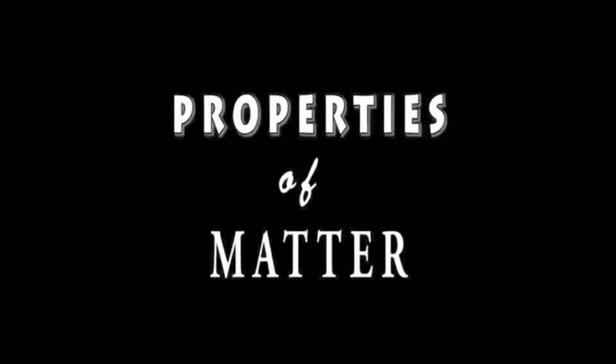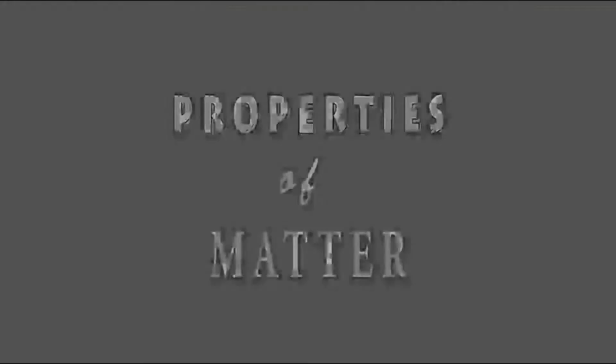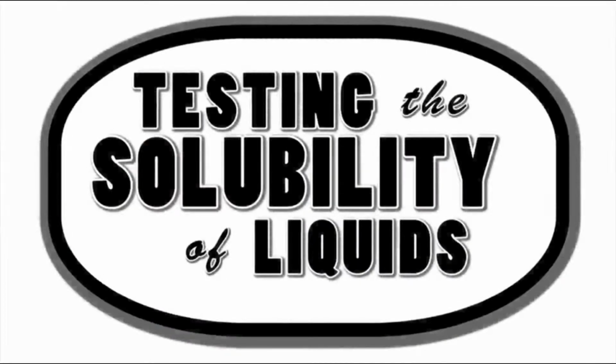Lesson on properties of matter. The topic for this experiment is testing the solubility of liquids.